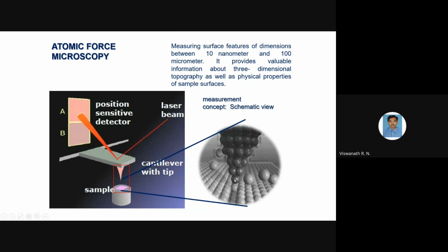So here it is atomistically, atoms in the tip and the sample. Now when I am coming closer, at equilibrium, you see this tip atom can easily see an atom at the surface of the sample. That is why it is called an atom probe. So we can map out the information atom by atom.